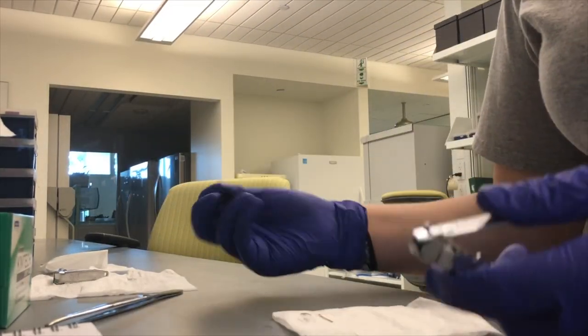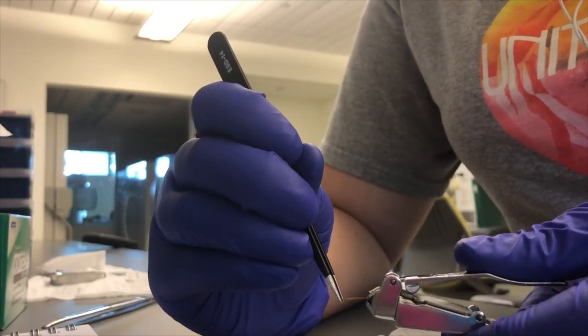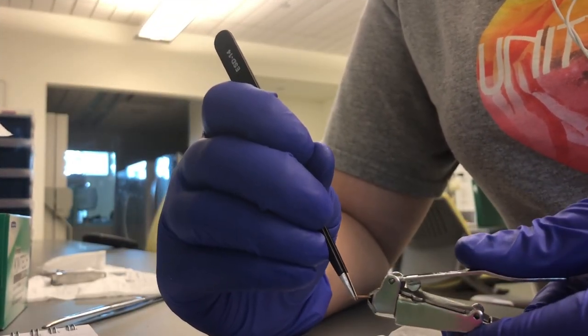This process was extremely time consuming and took a lot of patience. Typically, two to three spines were clipped per individual that tissue was collected from.